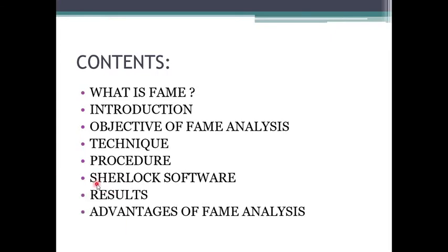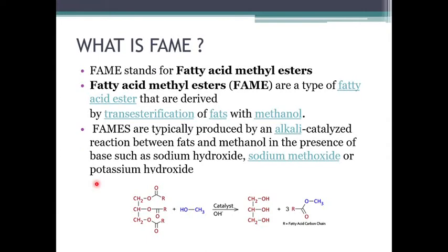The first question which comes into our mind by listening to this name is, what is FAME? FAME stands for fatty acid methyl esters. These fatty acid methyl esters are a type of fatty acid ester that are derived by the transesterification of fats. Now what is transesterification of fats?